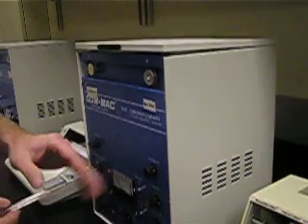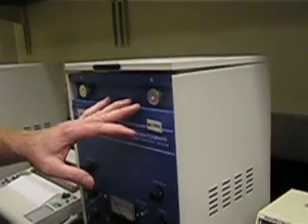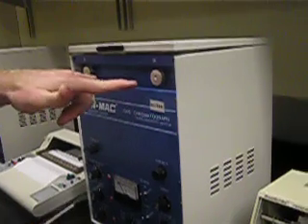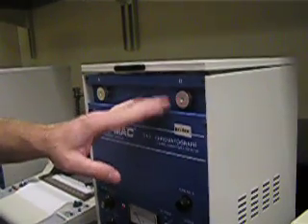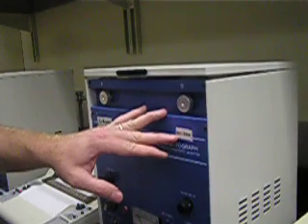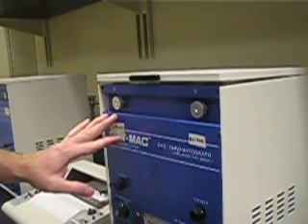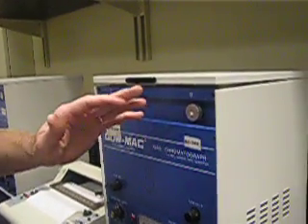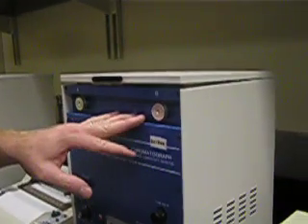This is the gas chromatograph we're going to be using today. We have not only the chromatograph, but the strip chart recorder, which I'll talk about later. We have two columns on the gas chromatograph. One of them we'll use — the DC200 or DC710. We're not going to be using the carbo wax, the polyethylene oxide based stationary phase. This 3238 class is only going to be using the DC200 or DC710.